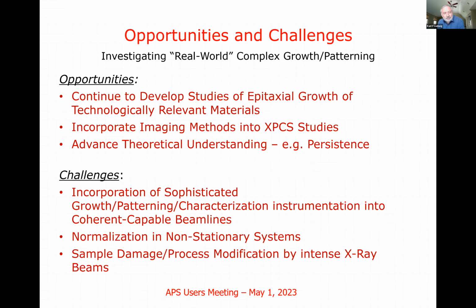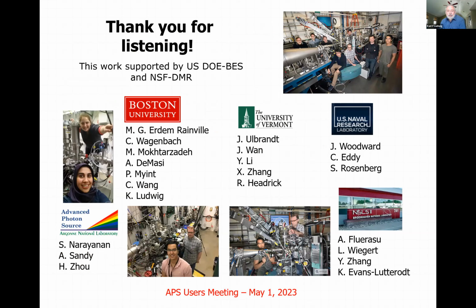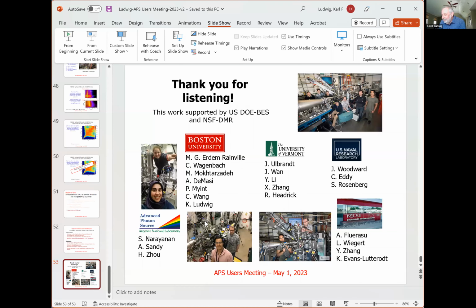Challenges, of course: incorporation of sophisticated growth instrumentation into coherent-capable beamlines. And normalization in non-stationary systems is always a big problem for us. And sample damage, of course, is something we have to worry about. So with that, I'll bring it to an end and thank all of my collaborators over the years.